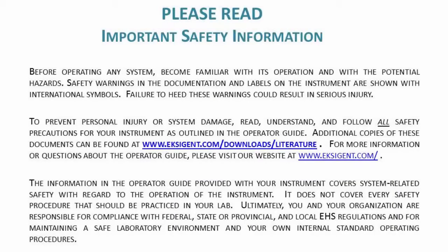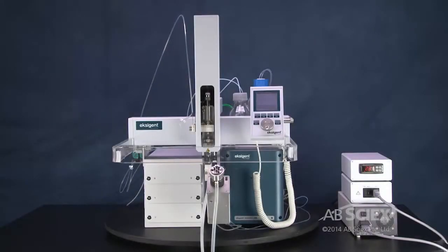Please read important safety information before watching this video. This training module covers the procedure for replacing the sample syringe on an Exigent MicroLC 200.